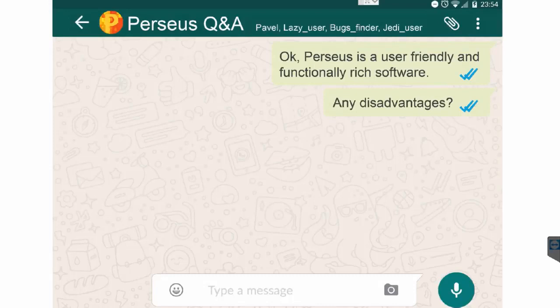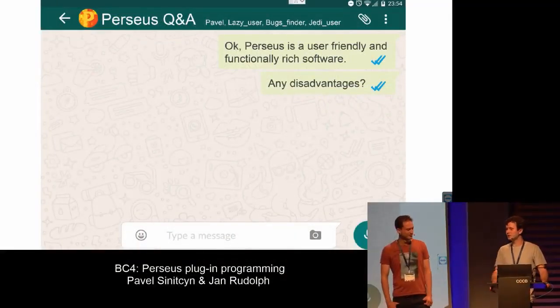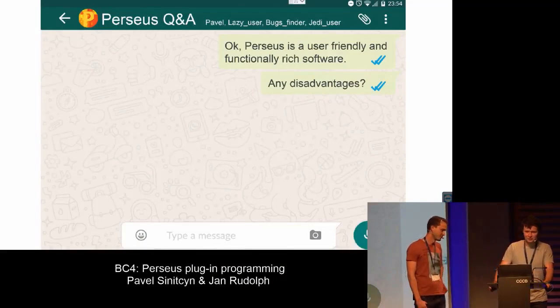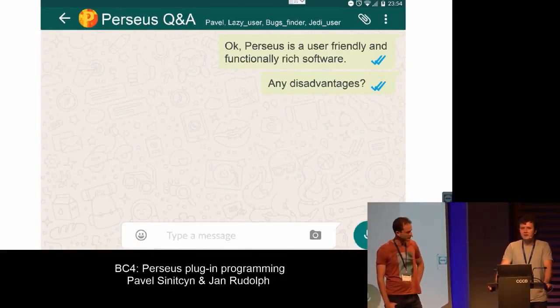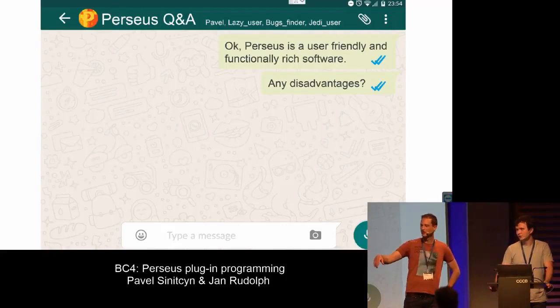Maybe one disadvantage we saw for at least 10 computers is that when you do clustering, you cannot cut the cluster. Sorry, it was really hard to find when we tested. We tested it several times and didn't find it, because our computers were all language specified. But are there any other disadvantages in Perseus? Yeah, you may say it loudly. Shout.